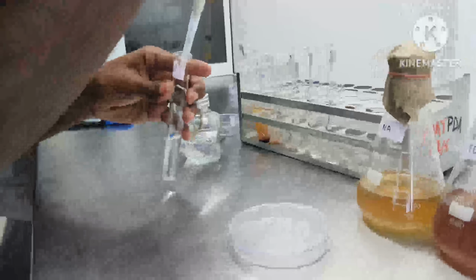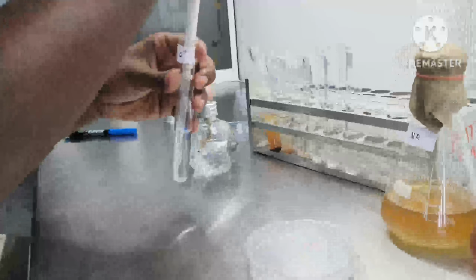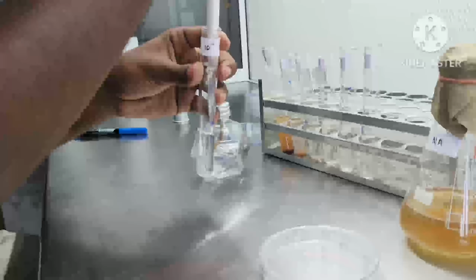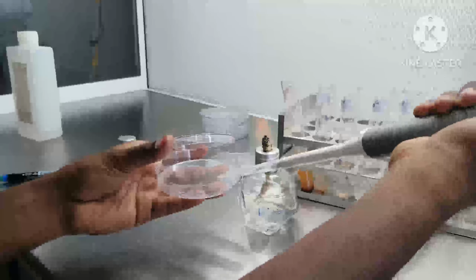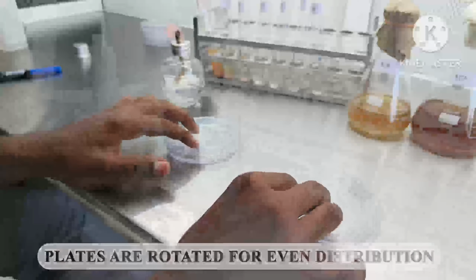Test tube containing 10^6 dilution was used for the isolation of bacteria. 1 ml of suspension was taken and was then transferred to a disposable sterile Petri plate. The plates were then rotated in the same manner done earlier.